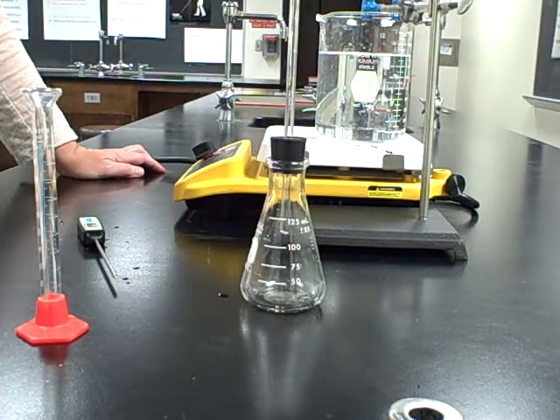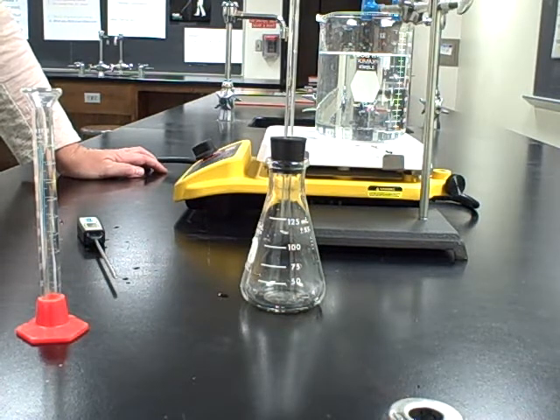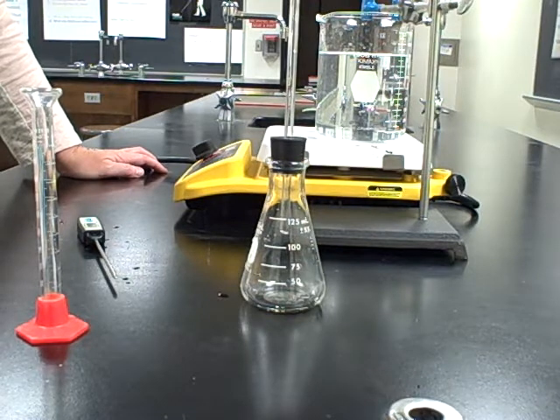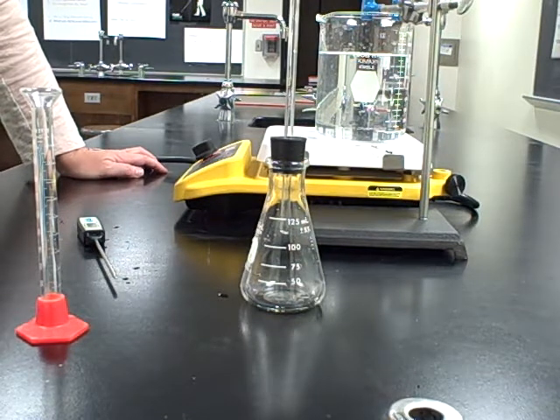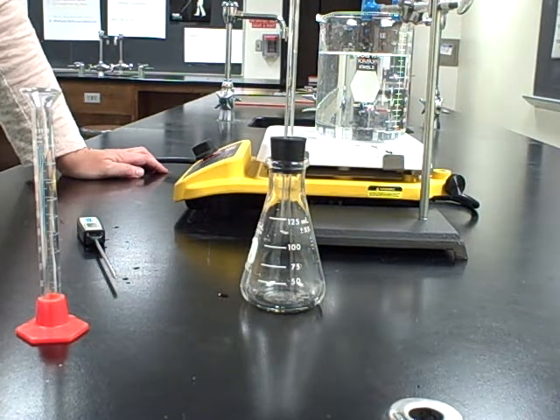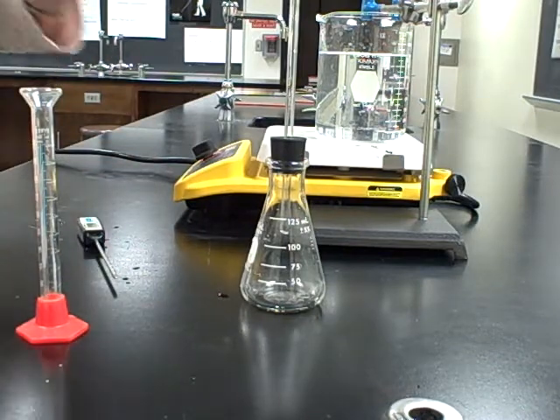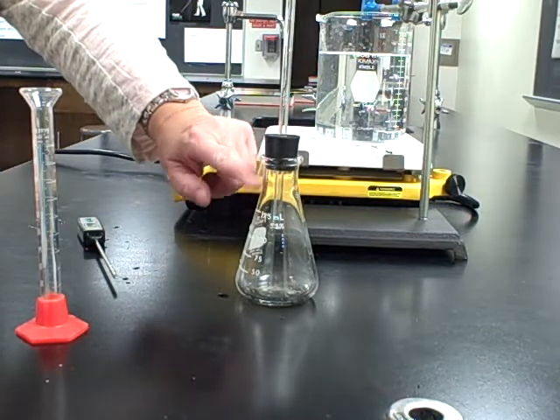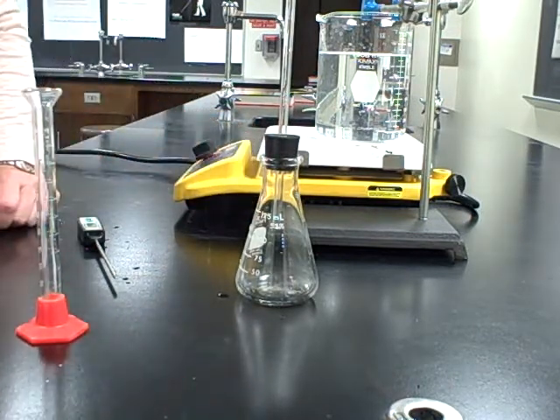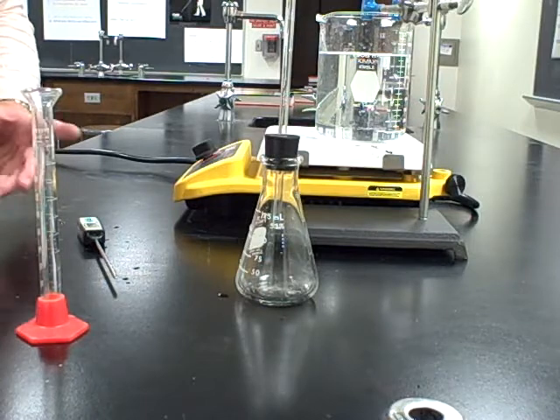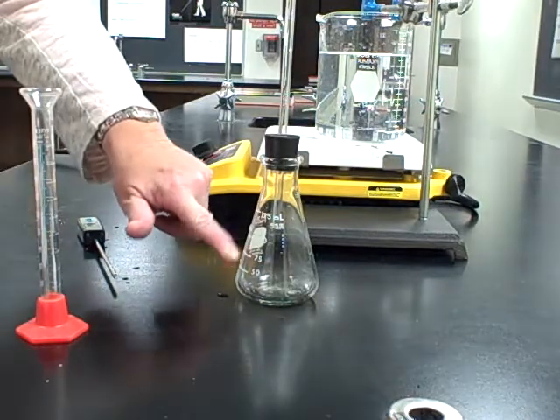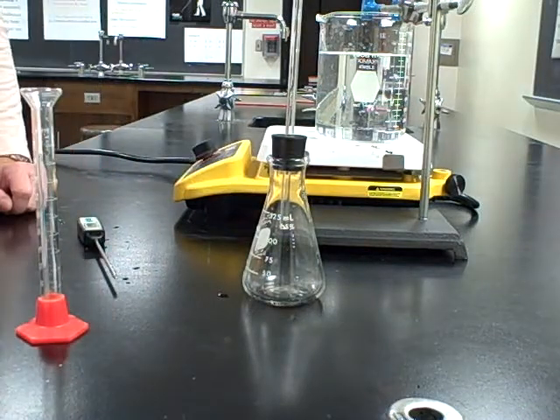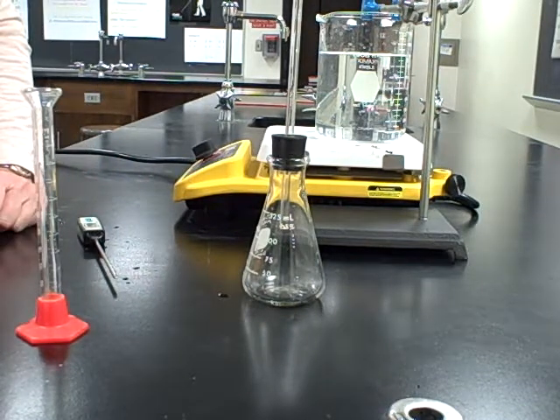Then you're going to go on and calculate the mass of the unknown present in the flask from those two measurements. The last step you really need to do before calculations is to find the volume of the flask occupied by the vapor. What you're going to do is take notice of where your stopper is in here, and then use the 100 milliliter graduated cylinder or you can use the big 500 milliliter one. Fill this up to that level with water, and that should be equal to the volume of gas that occupied that as well.